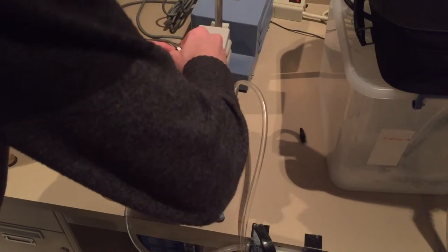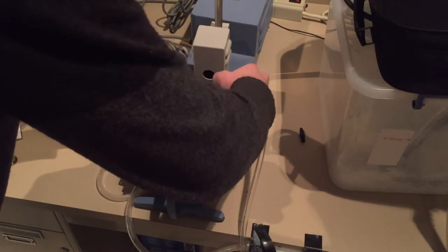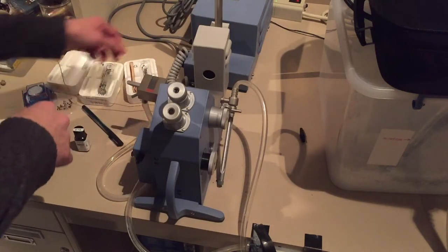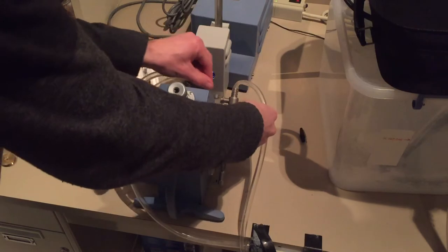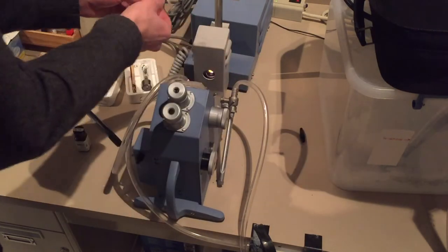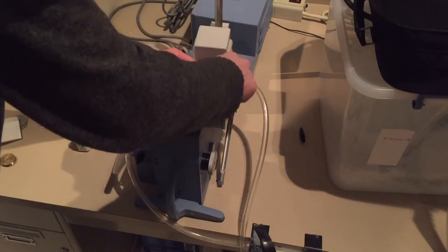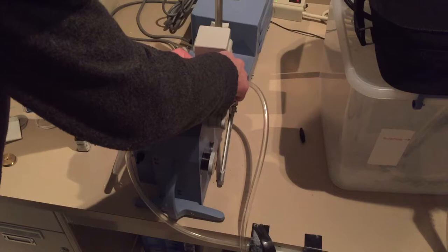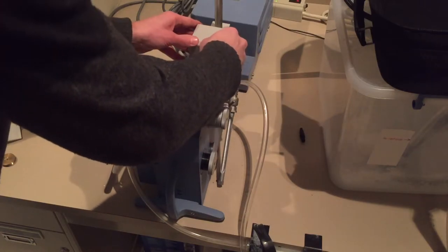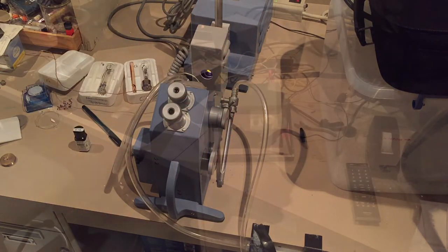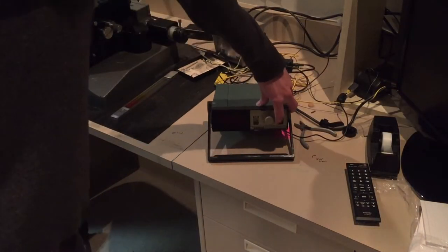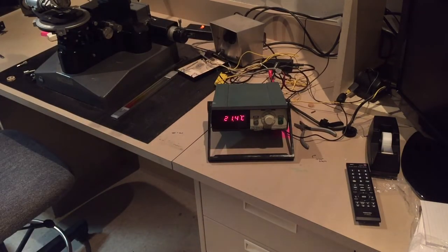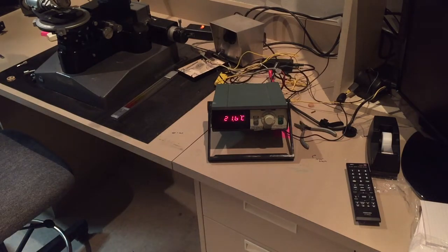And those other ones are for other wavelengths of light. This is a thermocouple so I can make sure what the temperature is near the refractive index liquid. Here's my multimeter for the temperature set on this thermocouple, and I'm going to turn the lights down or dim the lights here so it's easier for me to see the fringes.